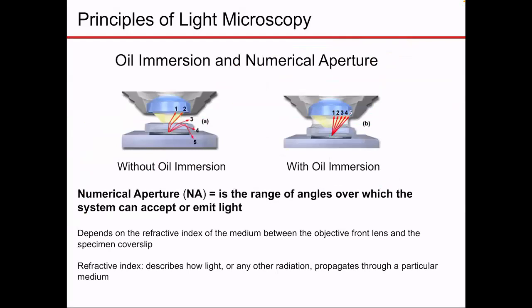So I mentioned to you that in microbiology, we use a lot one particular objective lens that is called the oil immersion lens, that usually has a magnification power of 100x. Why do we call this lens like this?